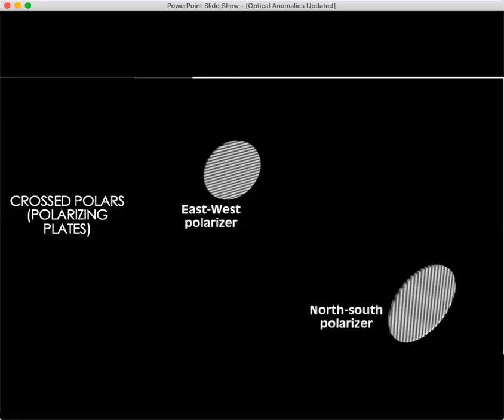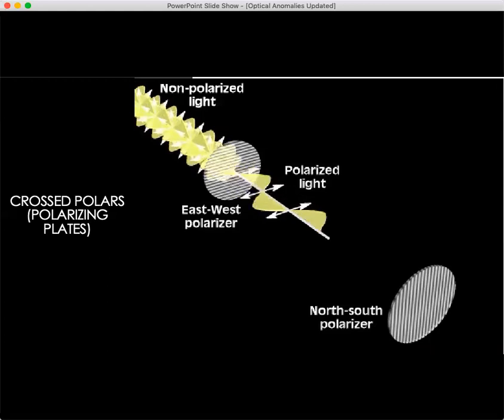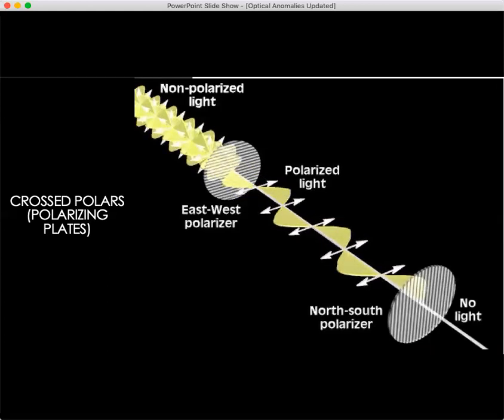This video models the way that light travels through the polarizers. Each polarizer only allows the light parallel to their filter to pass through. The polarizers are perpendicularly oriented to one another, and as a result, no light is seen as demonstrated in this diagram.